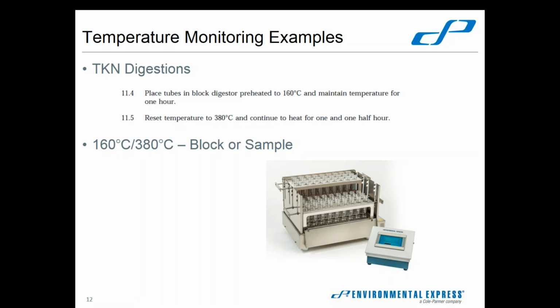I've actually tried that, and it never registered 380 degrees. The sand itself still has air pockets in there, and that temperature is high enough that it is driving heat out of those air pockets and heating the air above it, so that you can't get a measurement of 380 degrees using sand. And even then, we've still got the same temperature transfer rules of going from the metal block through the air around the glass tube, through the glass tube, into the actual material that you've got measured there.